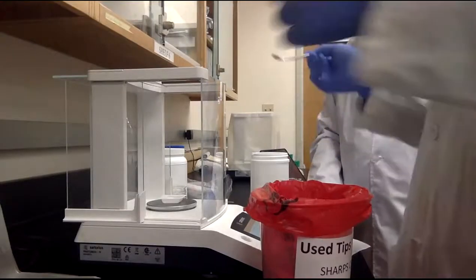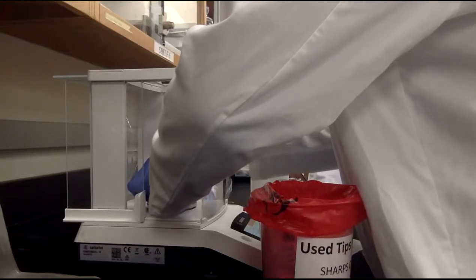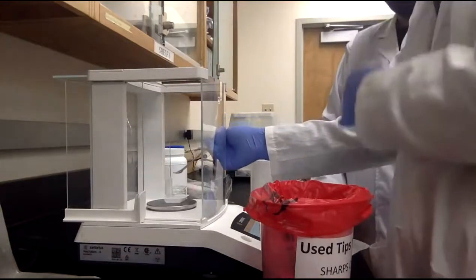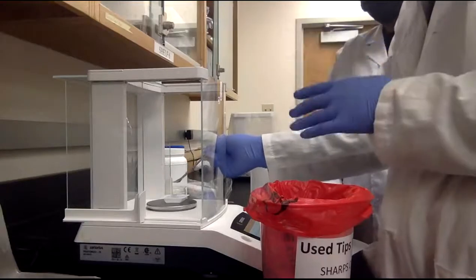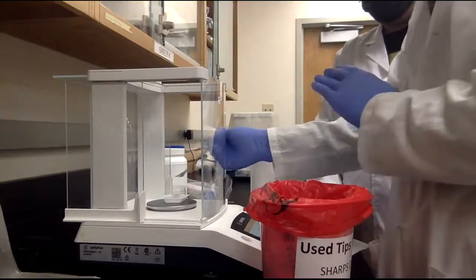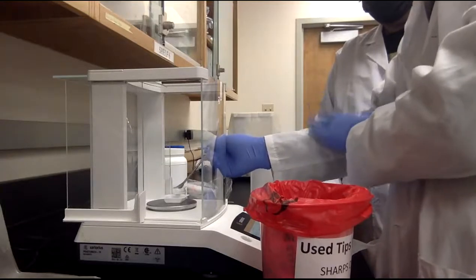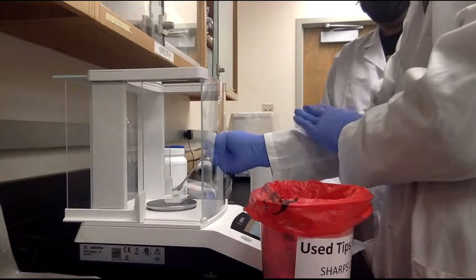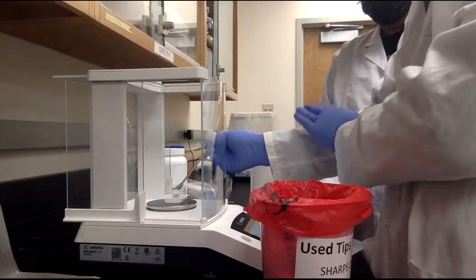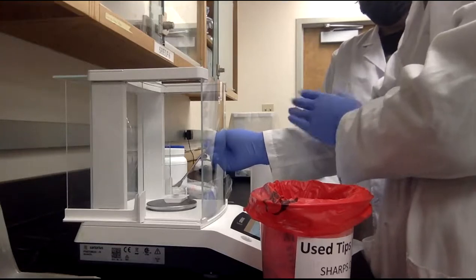Yeah, 680. Okay, now it's 666. So sometimes when you are getting very close to your desired number, you just get some of the powder, hold with your right hand, then gently push your right hand like this, so things get closer and closer. So now you have 680.